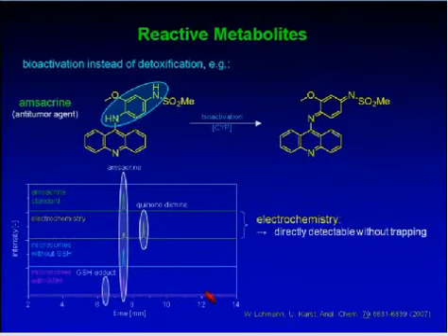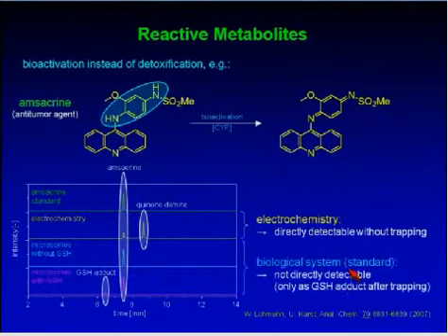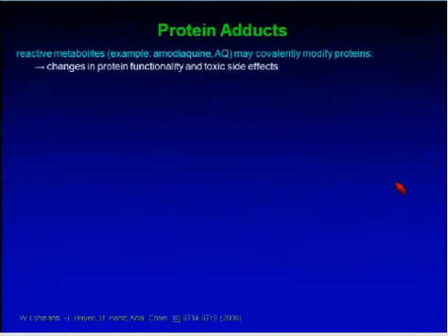In the second part here, we see just the glutathione adduct under the use of glutathione and the microsomes. And that means that in this case, we have to do the indirect steps, so we cannot directly detect the quinone diimine, but we can only detect it as an adduct with glutathione after trapping. Further information on this technique is available in this publication cited over here.